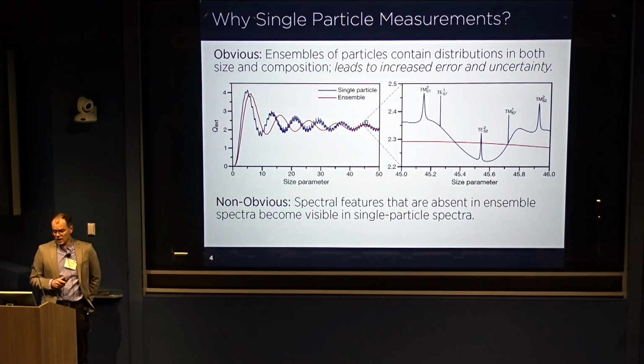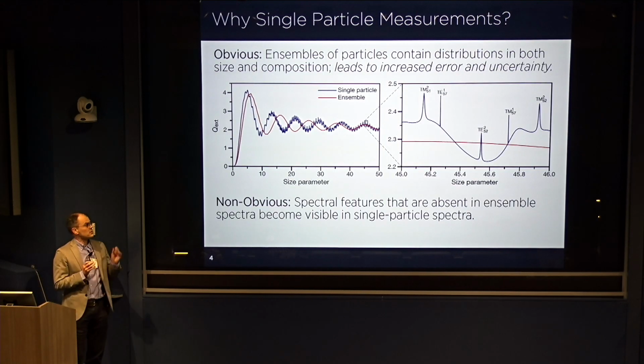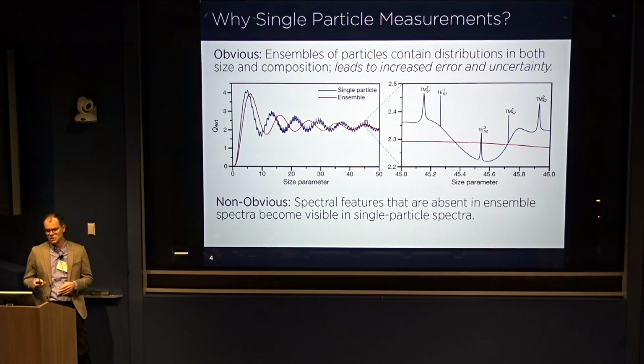And the reason to look at aerosols at the single particle level is, there are the obvious reasons: when you don't have a size distribution, you no longer have to worry about distributions in size and composition. So the error and uncertainty both improve.